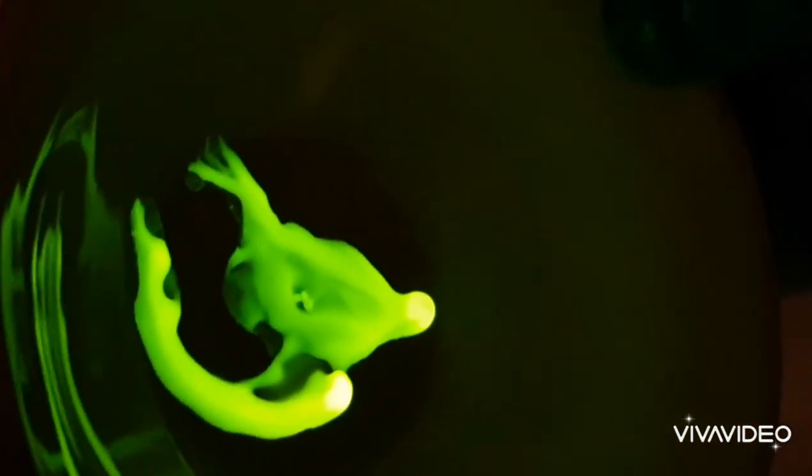I thought it'd be really cool to put this under the microscope and see if we can see any of the carbon dioxide gas as a byproduct of the reaction.